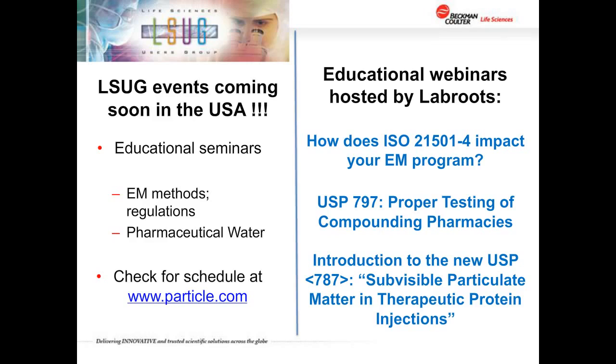Certainly it's something that's evaluated in the design and the manufacture of an instrument and tested, but generally it will not be changing in an instrument over time, because it's fundamentally based on the physical space of the detection area in the sensor, and that really will not change radically. If it might happen to, other aspects of the calibration method will pick up some radical disturbance of that area. So generally in the field, that particular function is not tested.